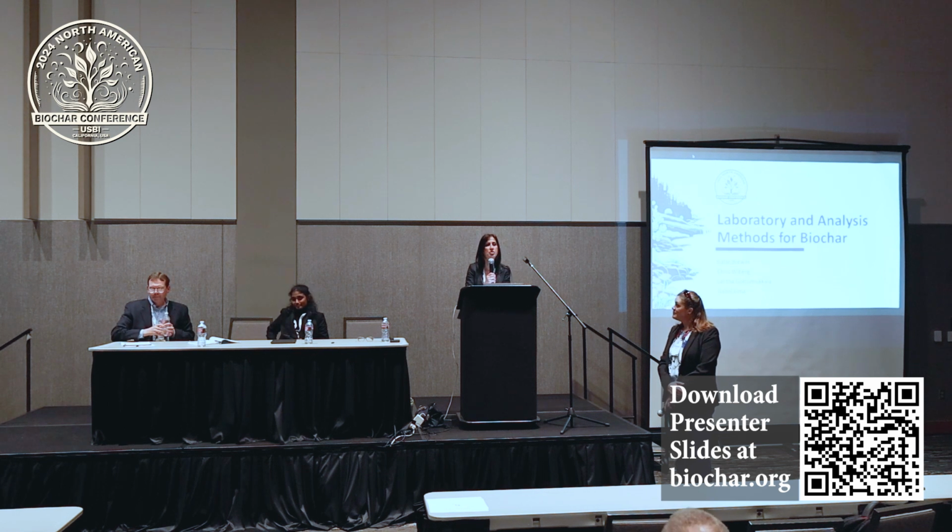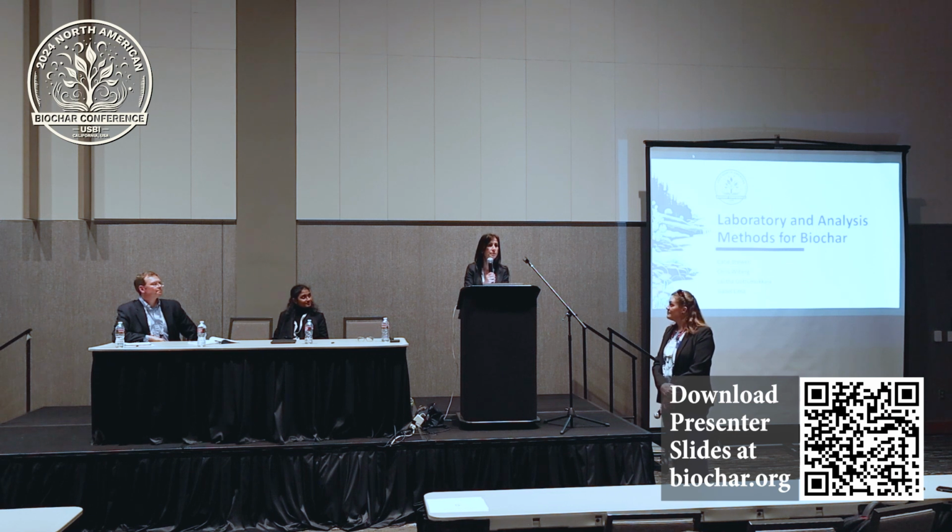We want to get this process started in terms of starting to develop some standard methods for biochar analysis. And it's probably going to be a long haul, but it's a worthwhile one.